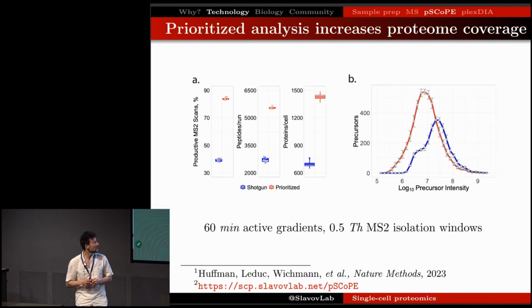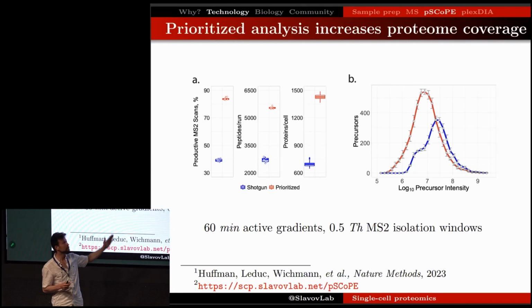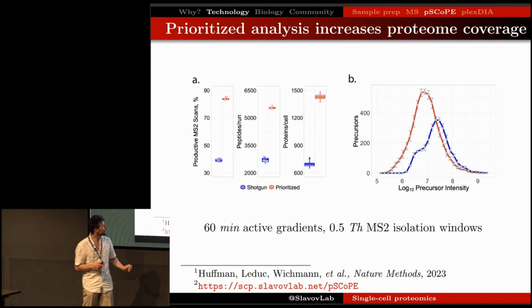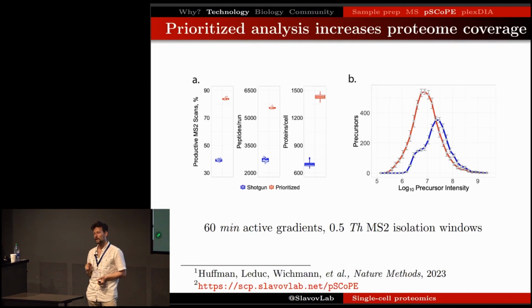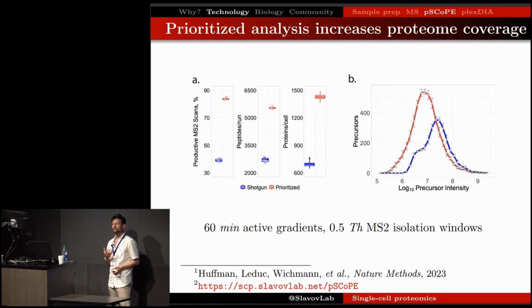real-time instrument control. And this also substantially increases the dynamic range of precursors that we can quantify. We are able to quantify less abundant proteins, including post-translationally modified peptides, as I'm going to show you later on. And we are doing this because we had such good control and good estimation of retention times in real time. We were able to sample elution peaks close to their apices, and this reduced co-isolation. So together with using very narrow isolation windows, we had a chance of achieving good quantification.